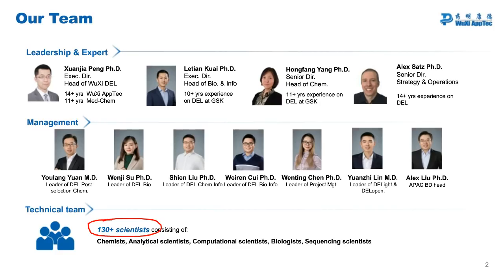What is the guarantee of obtaining a hit that is functionally active? Well, so these are cases where we don't know what the targets are. So we at WuXi don't know what your target is, and we don't know what your assay is. We also don't know what you're considering to be functionally active, because that can change from different project teams. So we don't guarantee that. What we guarantee is the quality of the DEL that we send you, but because you are producing the protein, you're running the screen, and you're setting up the assays, all that needs to be guaranteed just by you. We only guarantee the quality of the DEL that we're sending.